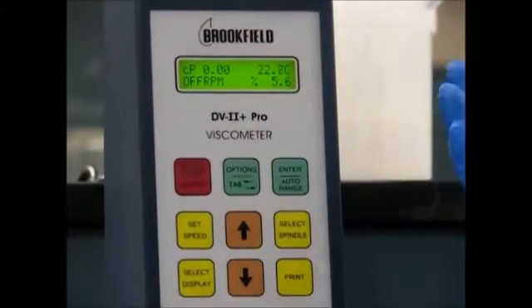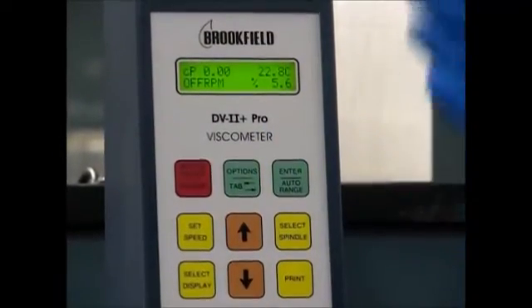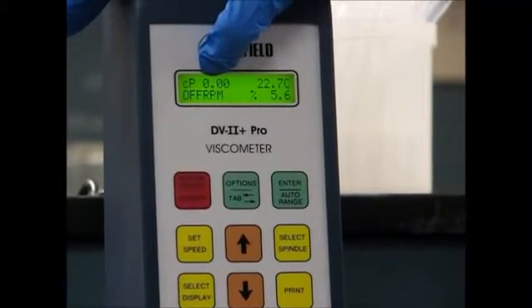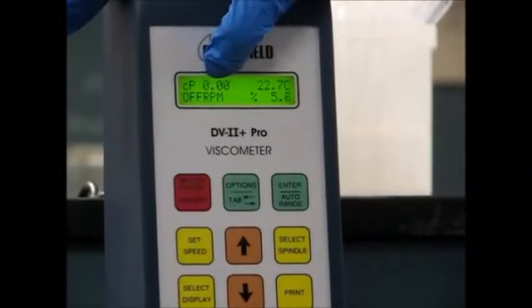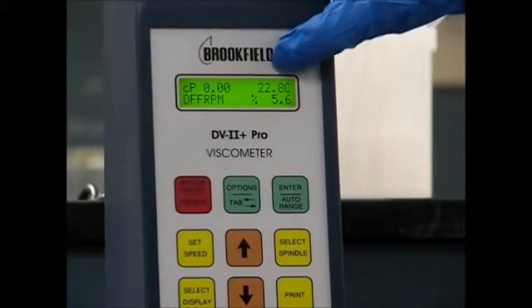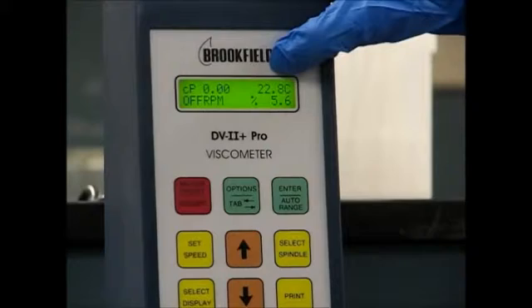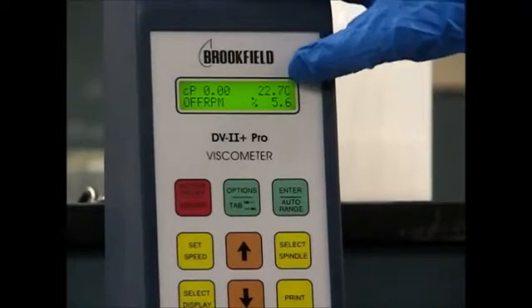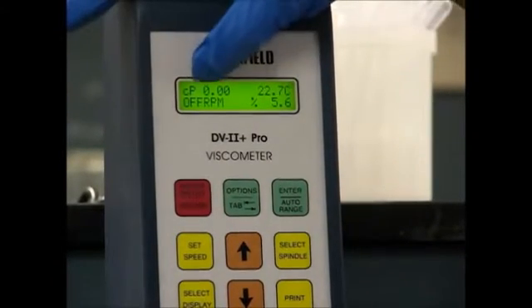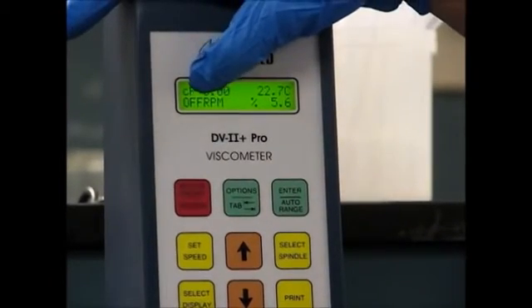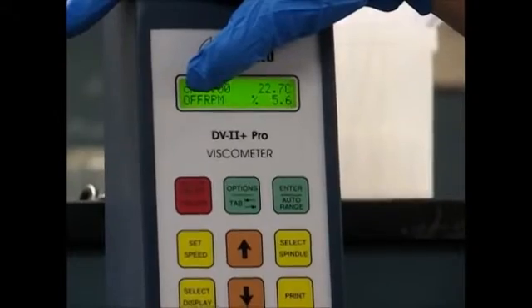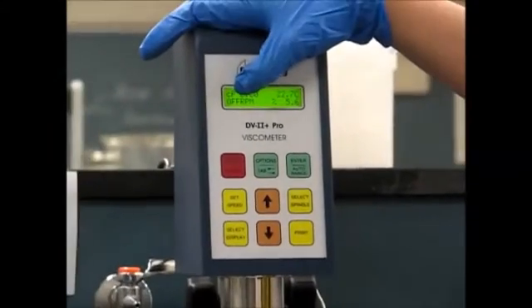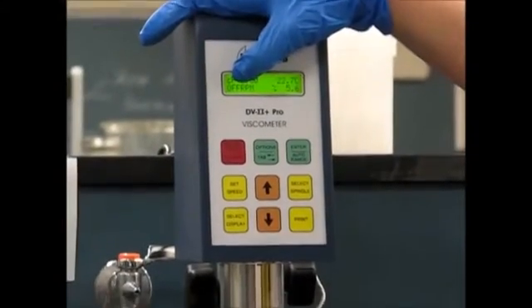There are four different things you can see from this display: the viscosity once the motor is turned on, the temperature of the fluid, the percent torque, and the RPMs. Right now it's off. We're going to be adjusting RPMs to take our measurements using the up and down arrows.